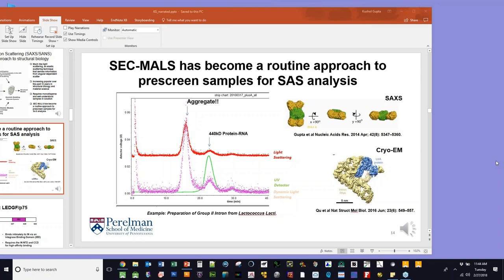All right. And so that's something I strive for and look for in any biophysical study I do where I implement 2, 3, 4 orthogonal biophysical measures, is that everything in the same buffer conditions and perhaps temperature and concentrations should be consistent with a known atomic structure and with the experimental conditions. If it's not, then something's up and I have to explain why that is. And that in turn is very useful for interpreting and constraining the interpretation of small angle X-ray scattering and neutron scattering data. So there's a lot of self-consistency that's built in and that you can utilize to make sure everything fits together. Exactly. It should be, if nothing else, internally self-consistent.